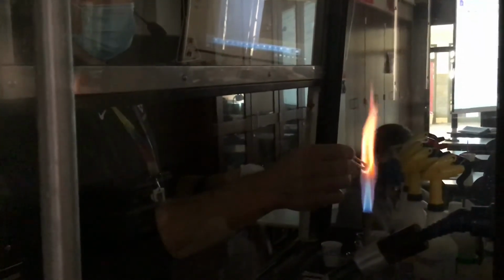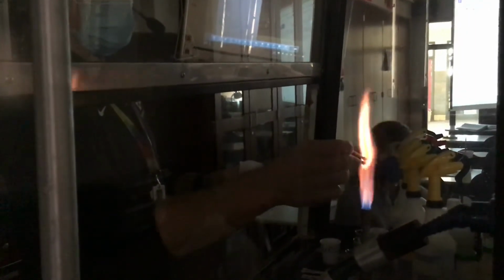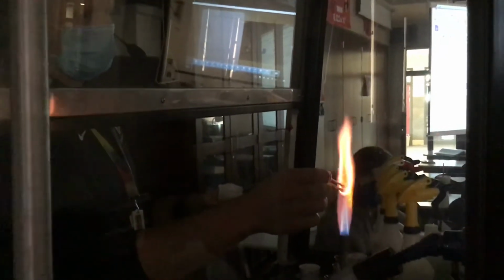Let's do potassium next. Potassium is tough to see. This is a trickier one than the other ones. Here's the potassium flame, but give it a little while, and then you don't get confused because there's some orange in there from the sodium. You might be able to see it a little bit on the side here. When I move it in and out, maybe you see a change to the flame color. So it's not real obvious with the Q-tips. I think it works pretty good in the spray bottle.